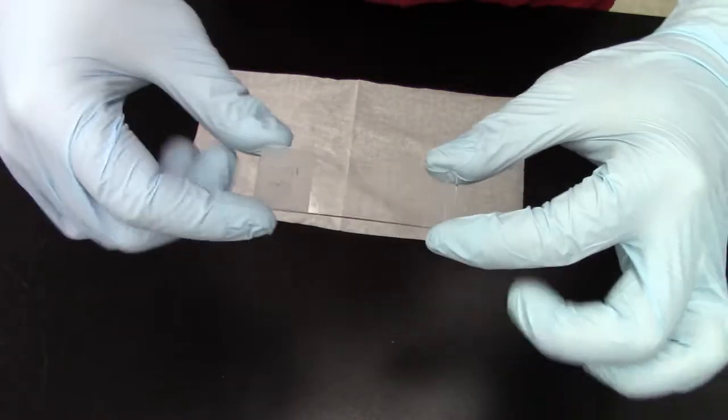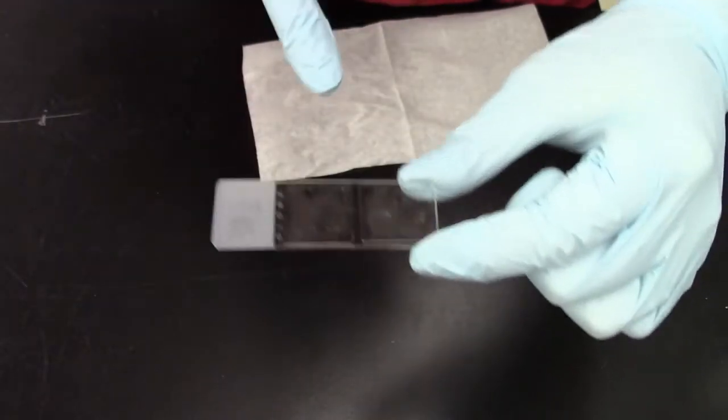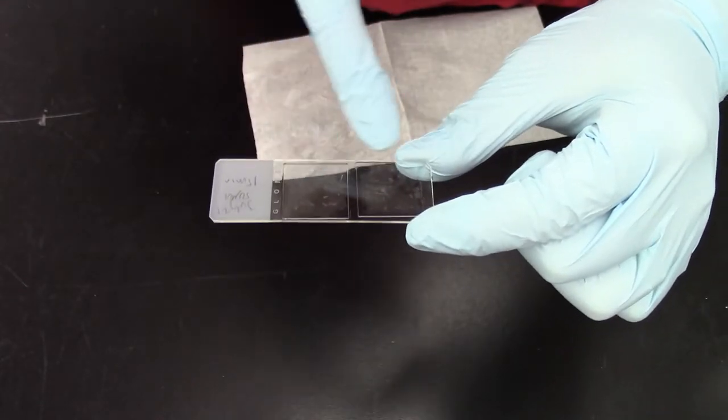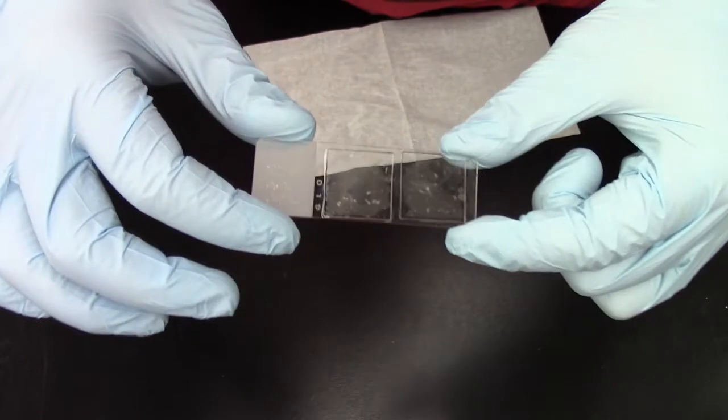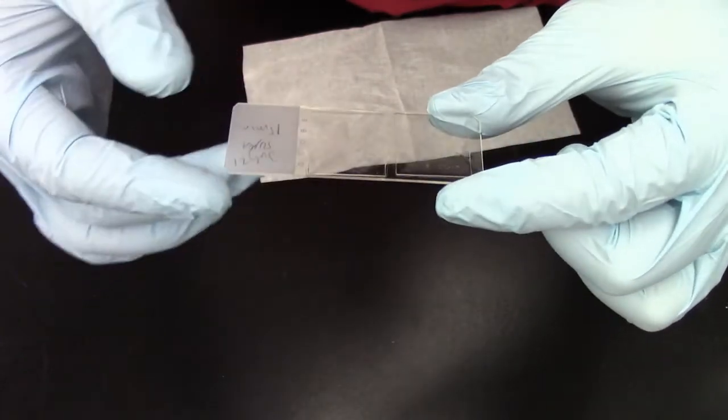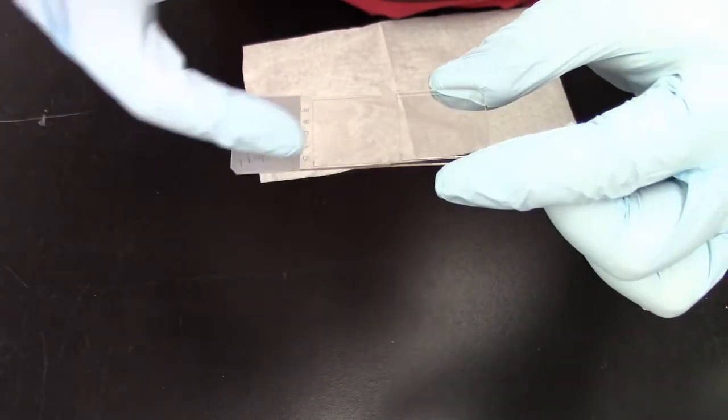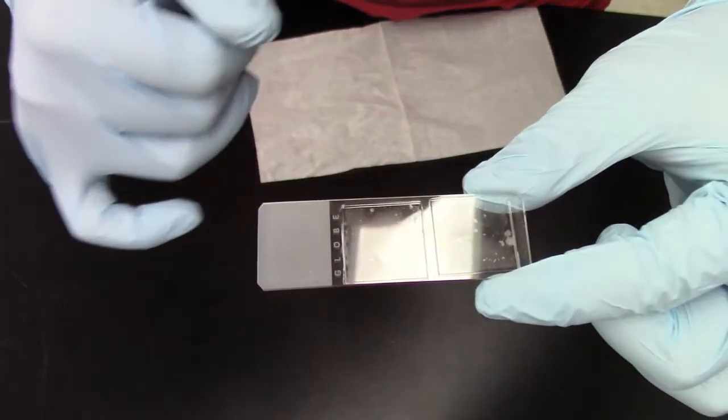So here we have our slide and as you can see on my slide I have two coverslips. Each one of these coverslips has some cells on it that have been stained in our last lab. Obviously if you look at the slide it has a name so this name indicates what exactly I have on my slide.